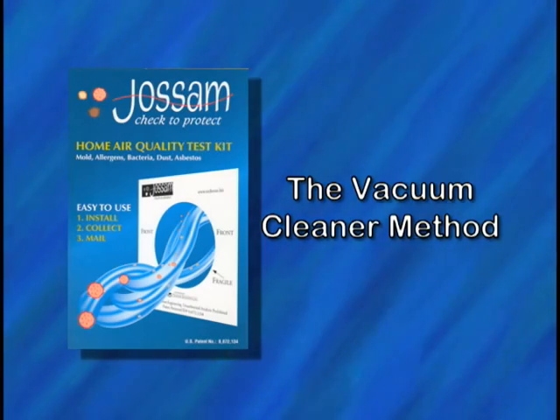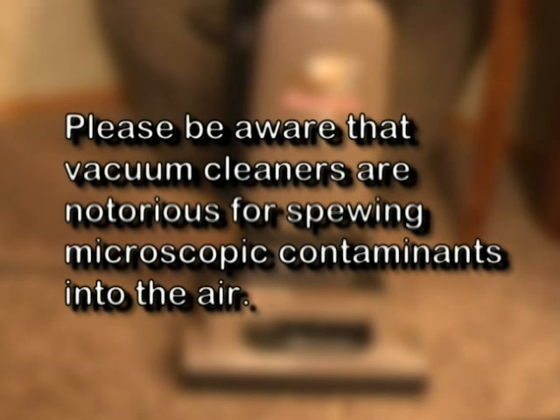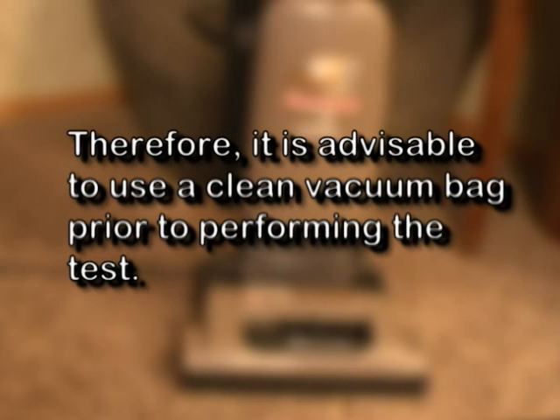The Vacuum Cleaner Method. This method should be used if you wish to sample a particular room or wish to sample the exhaust air from your vacuum cleaner. Please be aware that vacuum cleaners are notorious for spewing microscopic contaminants into the air. Therefore, it is advisable to use a clean vacuum bag prior to performing the test.